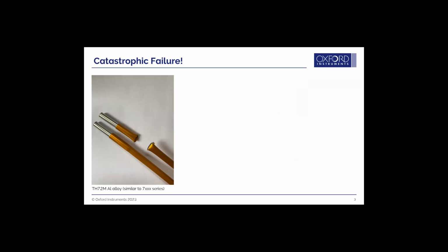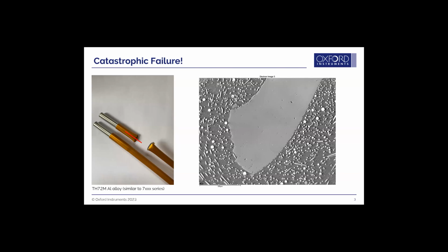And given the researchers that were on this trip, they have EBSD. They go, let's dig in and find out what really caused the problem here. So they started with a little bit of sectioning, a little bit of sample prep, and locating what was potentially a crack initiation site, and really getting to the bottom of whether we can figure out what really caused this problem. So that's the micrograph at low mag.